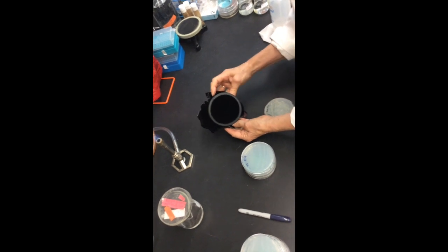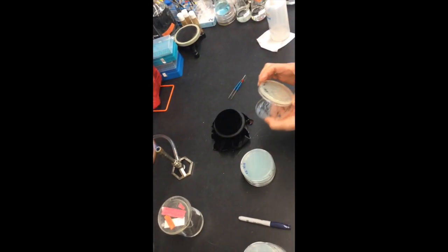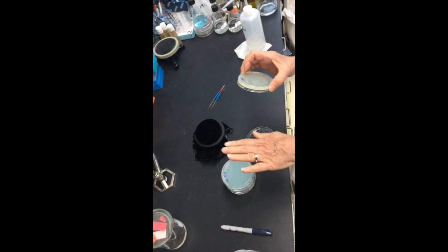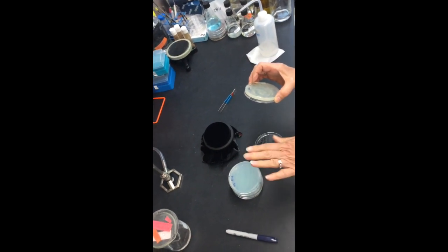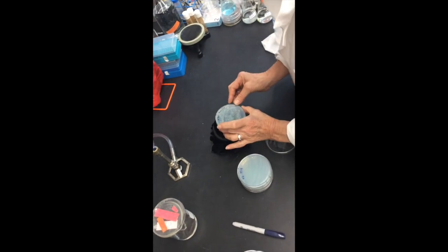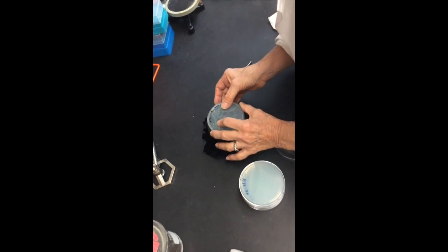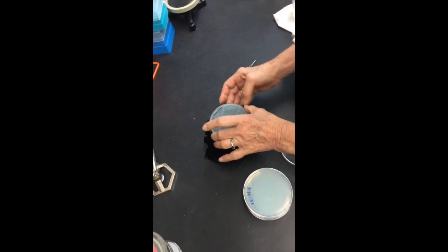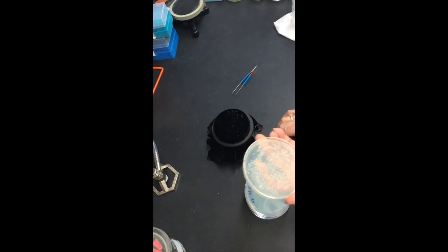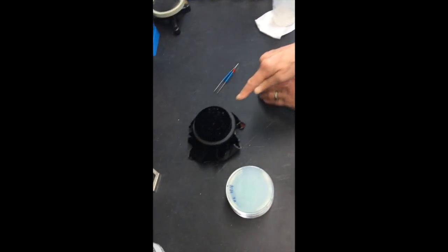And you'll notice that I have a little mark on this. So we're going to line all the plates up so that we're basically doing a Xerox, stamping the cells from this plate onto all of the other plates. In this way, I'm going to put my plate down, line it up with that mark onto the velvet, and press it lightly, and you see that the cells are still there, but it's got a bit of an impression now, and you can actually see them on the velvet.